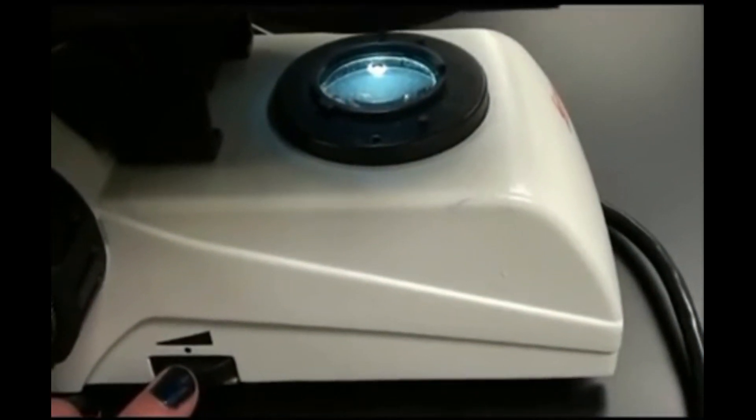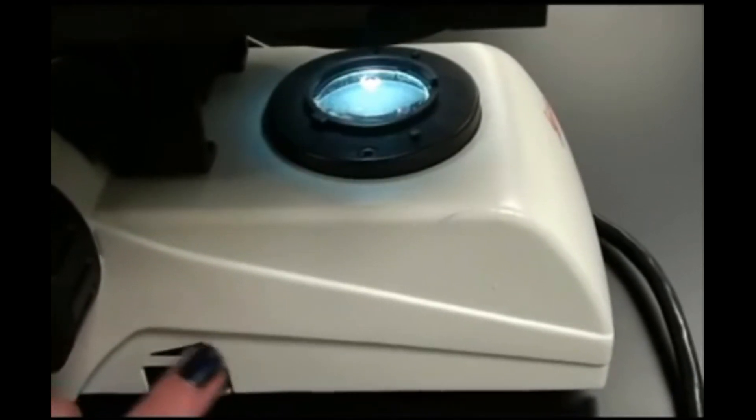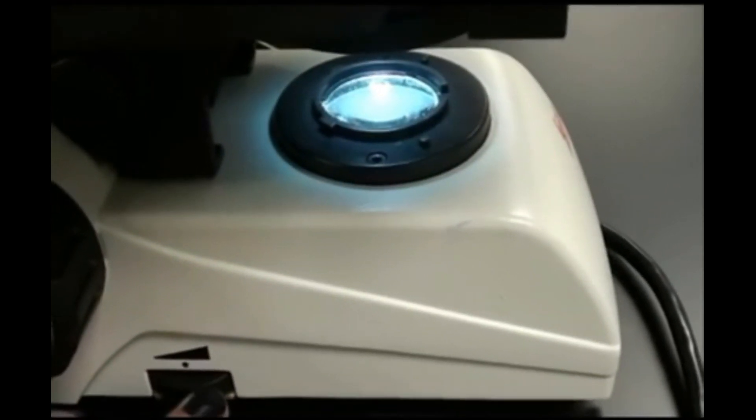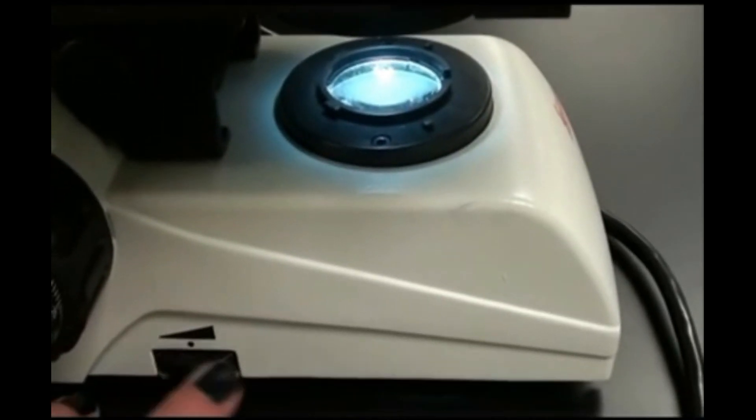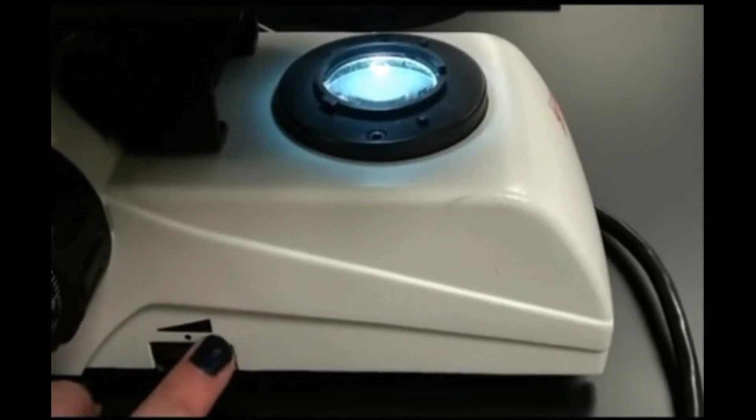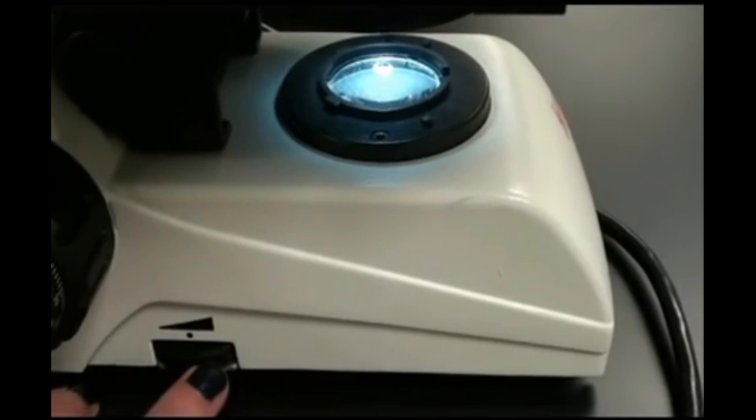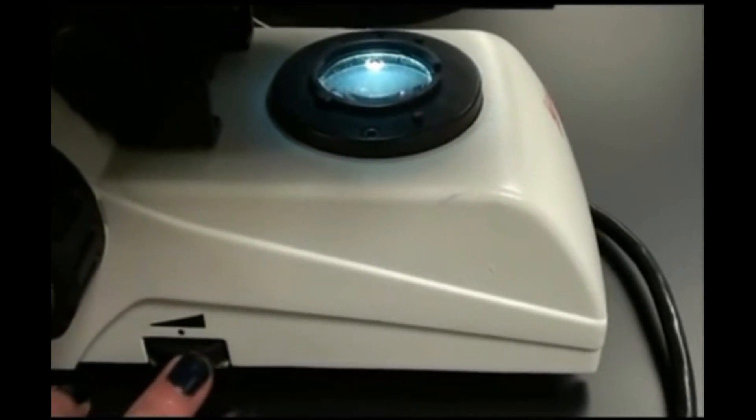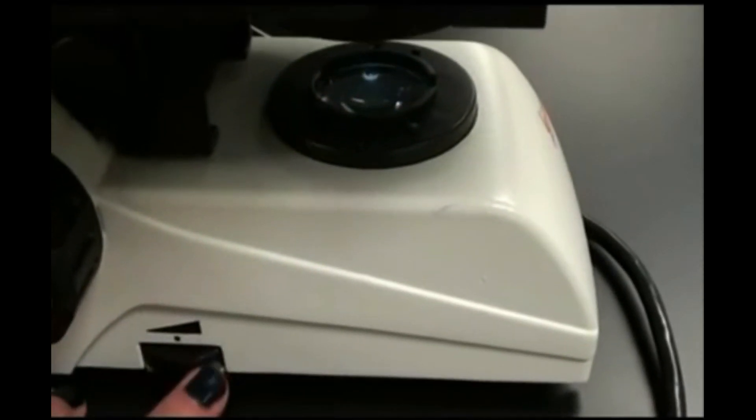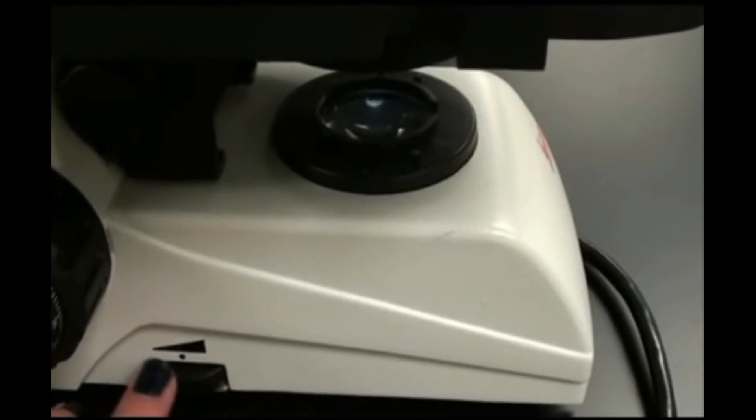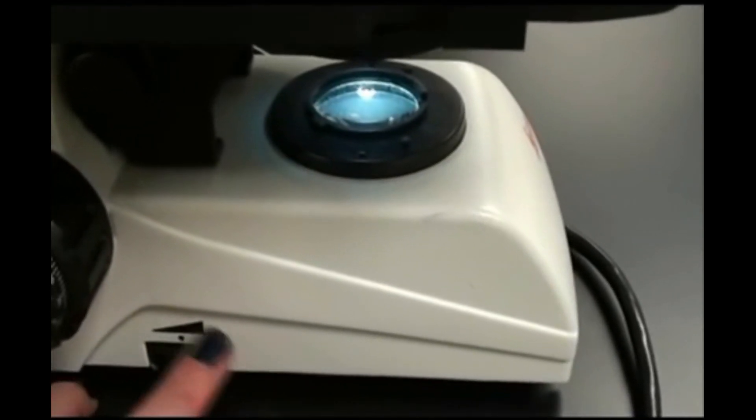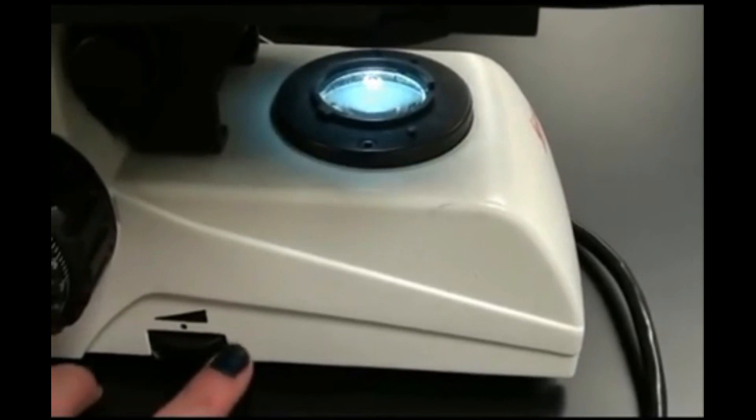Understanding how to adjust the amount of light that is shining through your specimen is an extremely important skill to have. Too much light and your specimen can be washed out. Too little light and there is not enough illumination to see it. Adjusting the light allows you to manipulate contrast. That is the difference in the visibility of your specimen versus the background.